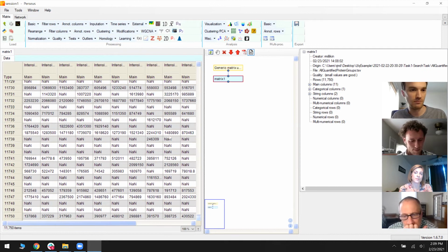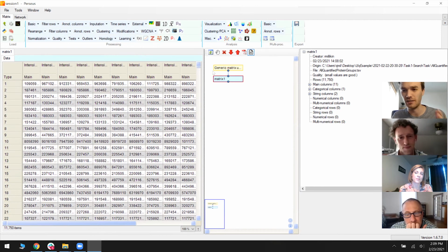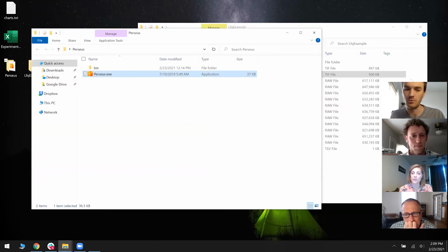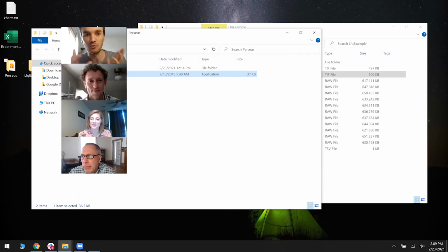And I can go through that if you want. It takes a couple minutes, but it's not too bad. And then with this data set, at an FDR of like 5%, I think there's actually maybe 8% or so that are human and significantly changing, so they're incorrectly changing. But the FDR control is pretty good for t-tests and stuff. It's not amazing, but it's not bad. So that's the basics of quant, and some cool charts you can make.